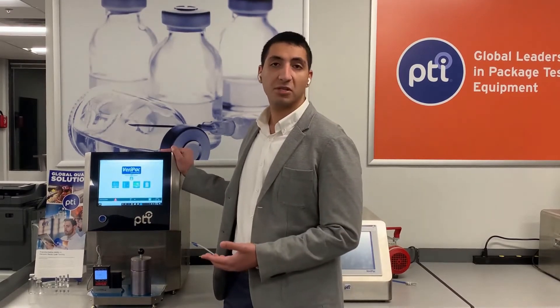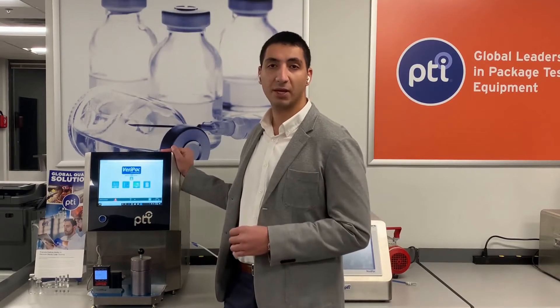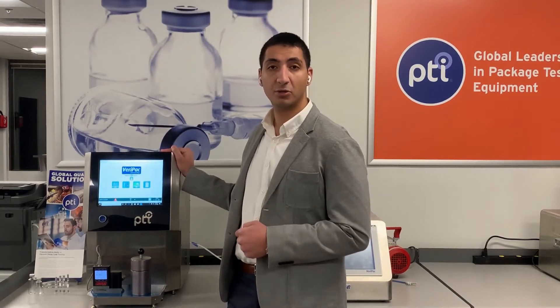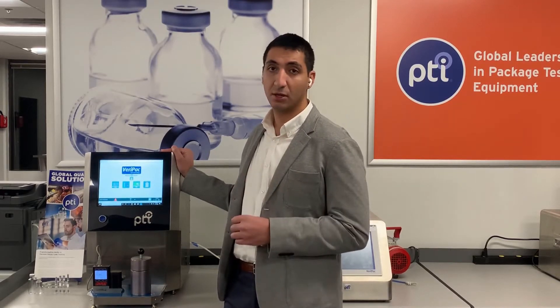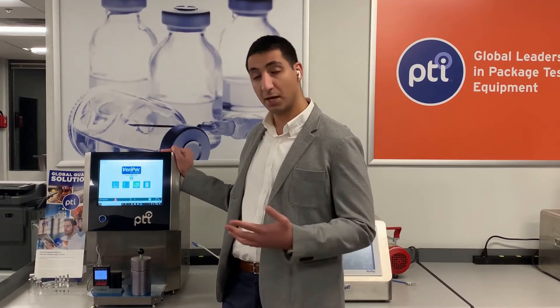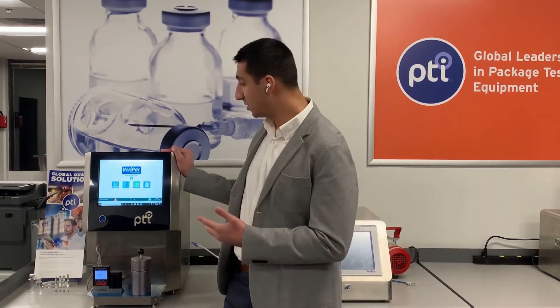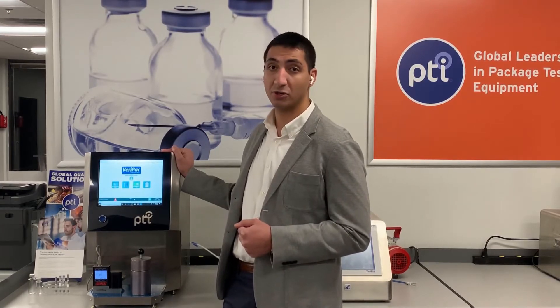The Varapak 465 is PTI's dual transducer differential vacuum decay non-destructive leak test system for container closure integrity testing of packages that require detection of the smallest of leaks. Many of you already know that detection of defects below the size of one micron are critical, as described in the Kirsch study of 1997. This system, the Varapak 465, boasts detection capabilities in the sub-micron range.